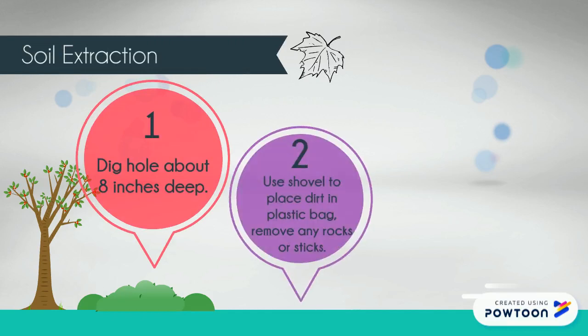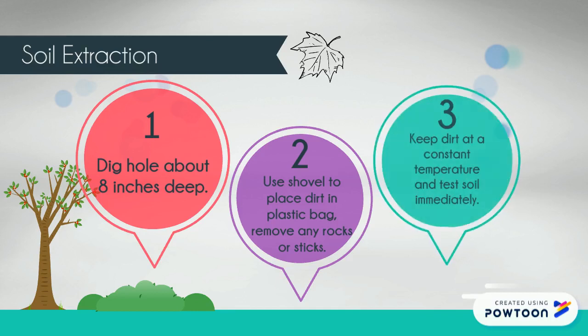At each site, we used a shovel to scoop soil into a 10-ounce bag, removing any rocks or sticks in the way. And finally, we transported the sample back to the lab where we analyzed the materials immediately.